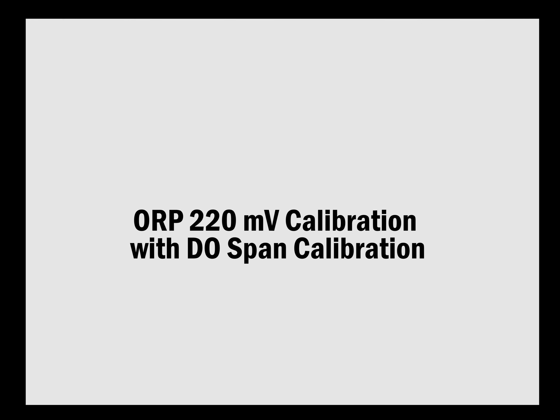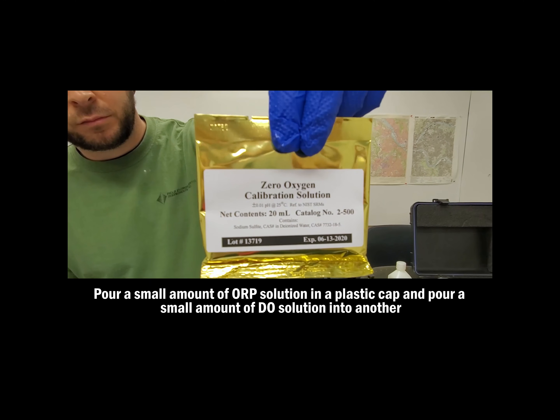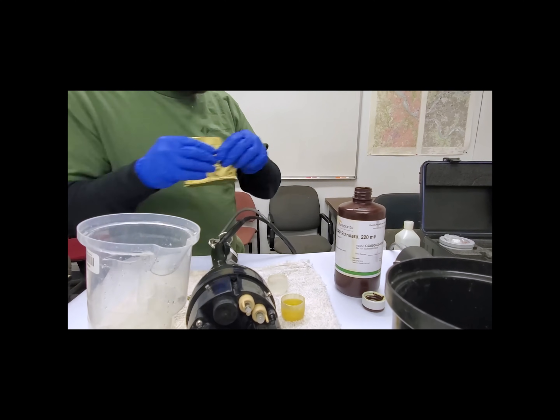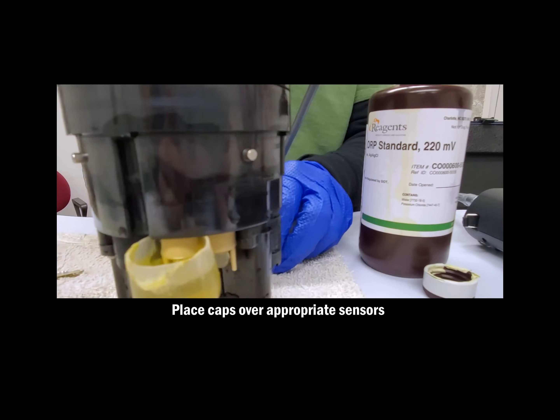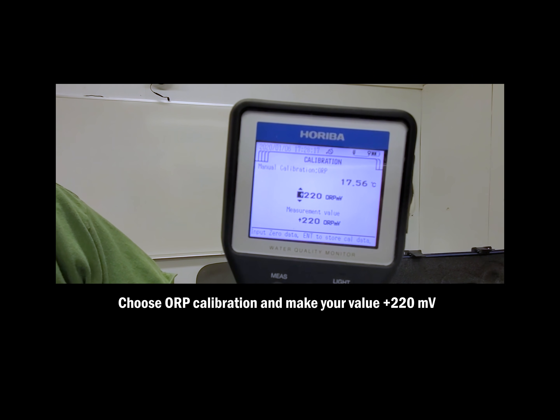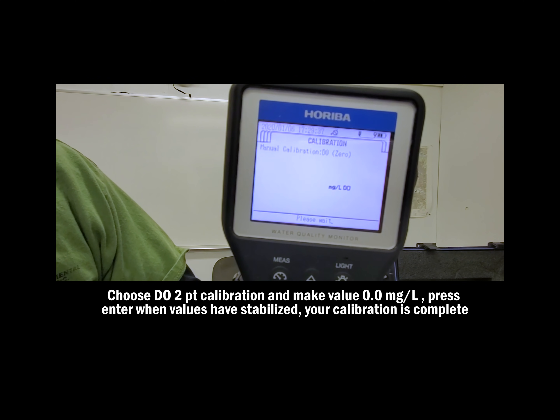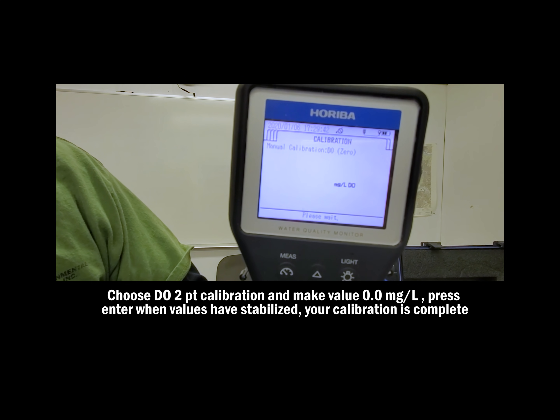We're going to complete two calibrations at the same time. The first is ORP 220 millivolt, and the second is the galvanic dissolved oxygen. In order to do this, you'll need two small plastic caps — this is the best way to do it because they fit right onto the probes. Put ORP standard in one cap and the DO solution into another, and place them over their respective probes. First, calibrate your ORP and make the value 220 positive millivolts. Then complete a two-point calibration for dissolved oxygen, making your value 0.0 milligrams per liter.